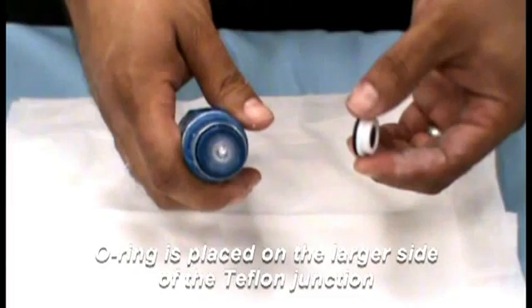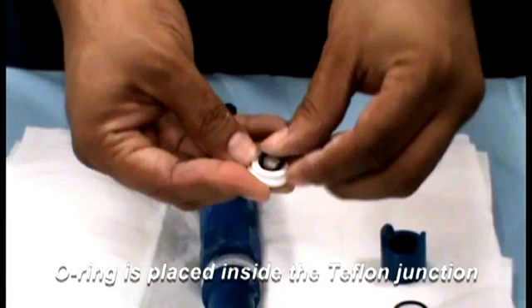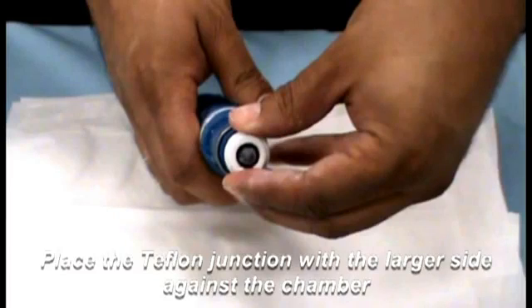The large O-ring is placed against the chamber as a seal. The smaller O-ring is placed on the inside of the junction to seal against the glass. Place a new junction with O-rings onto the front of the chamber.